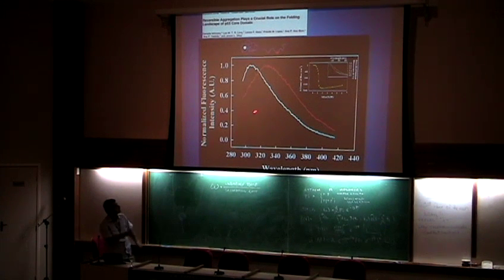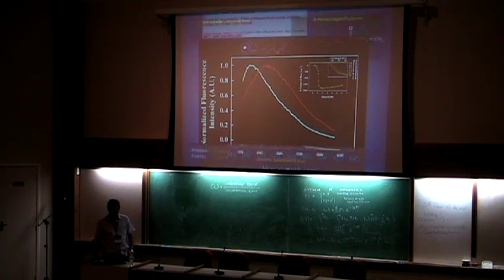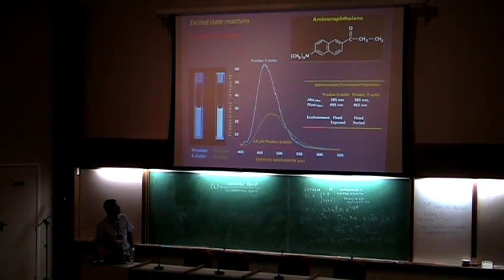I won't talk about the protein right now, but as you increase the guanidine hydrochloride concentration, you shift the spectra to the red as the tryptophan becomes exposed, so you can do a titration curve. Instead of plotting the average wavelength, the best way to do it is to plot the average change in the energy as the spectrum shifts to higher wavelengths.